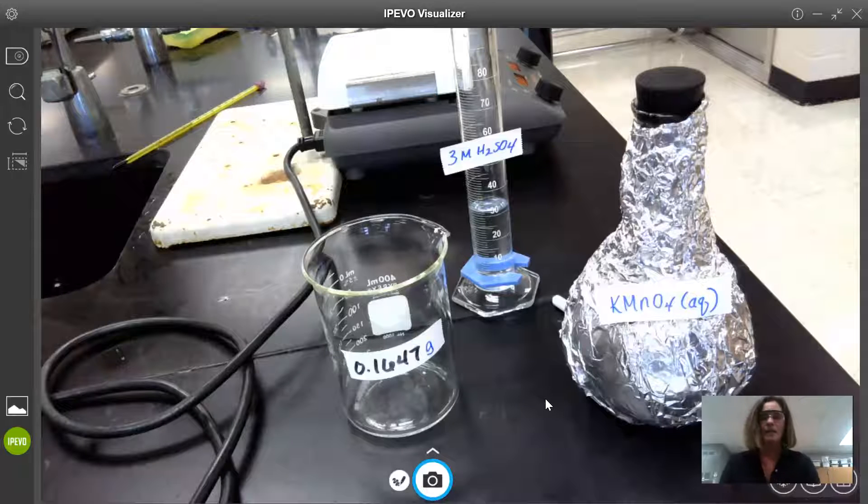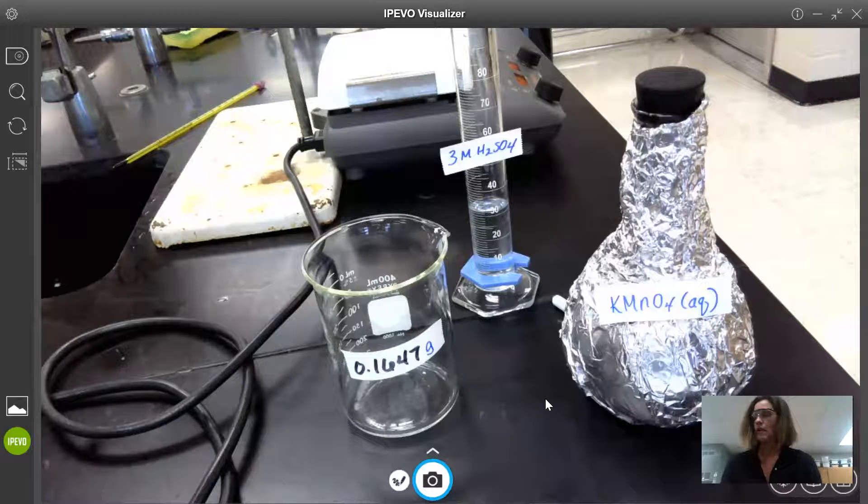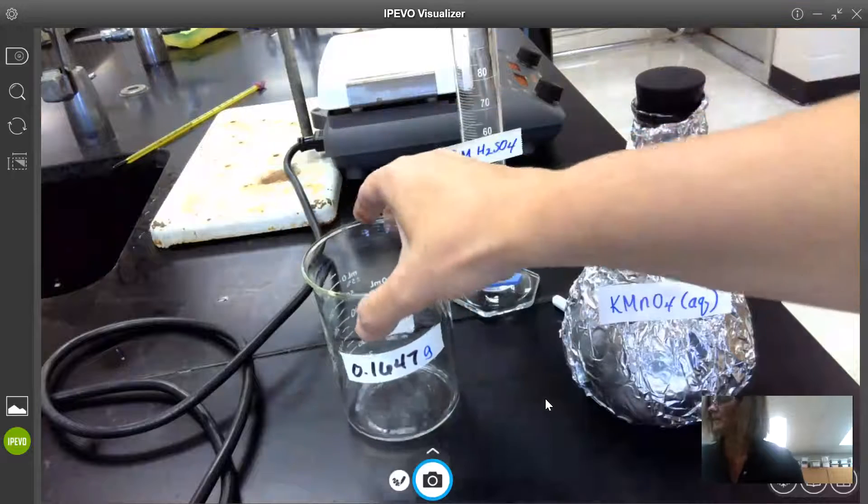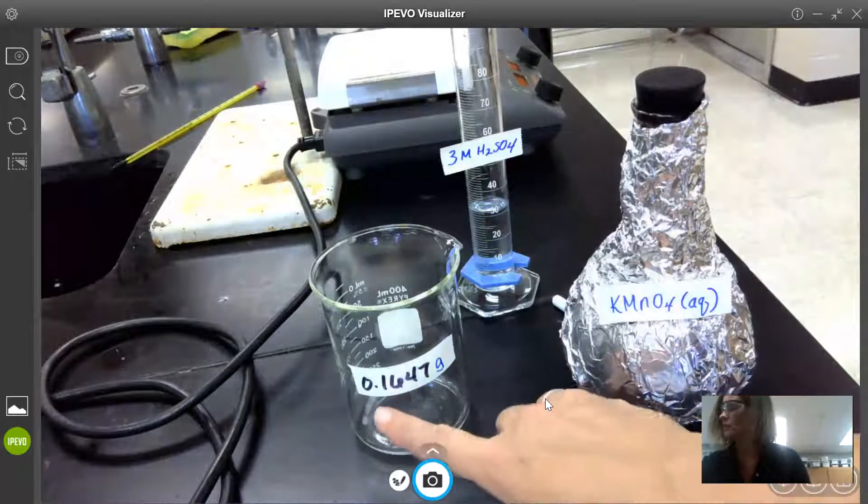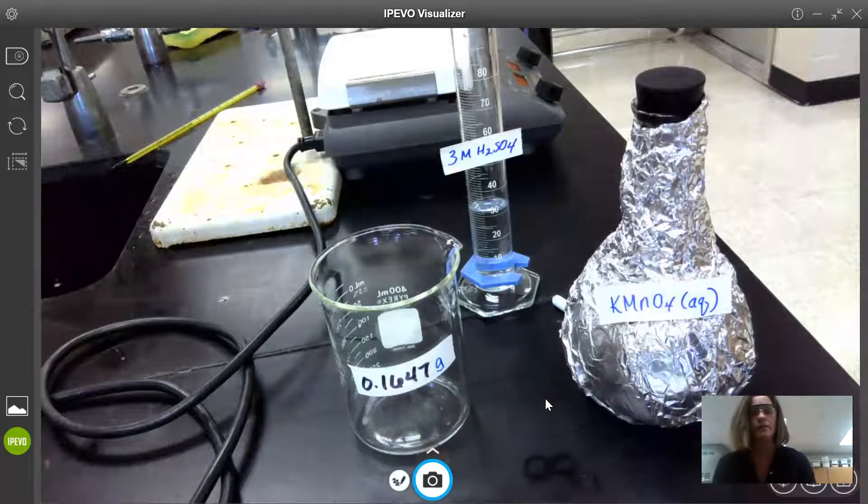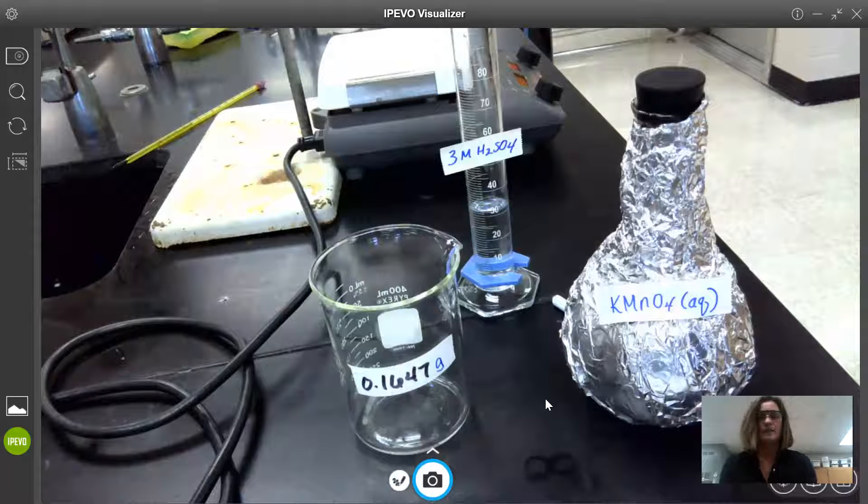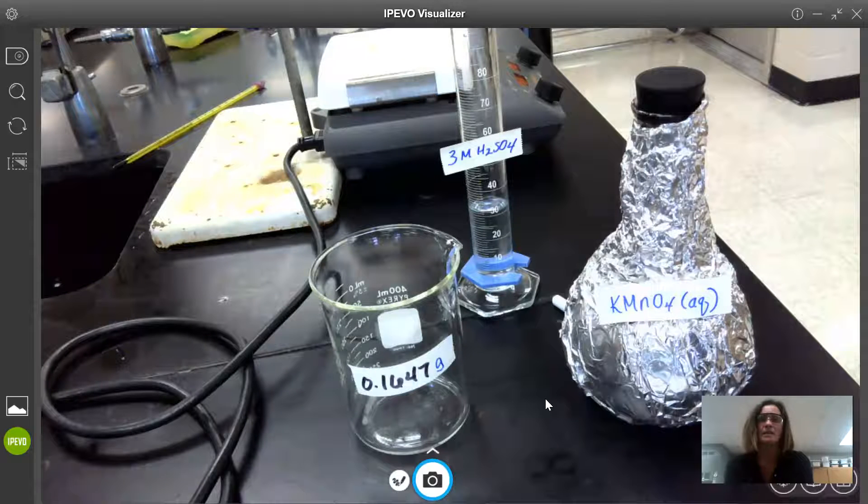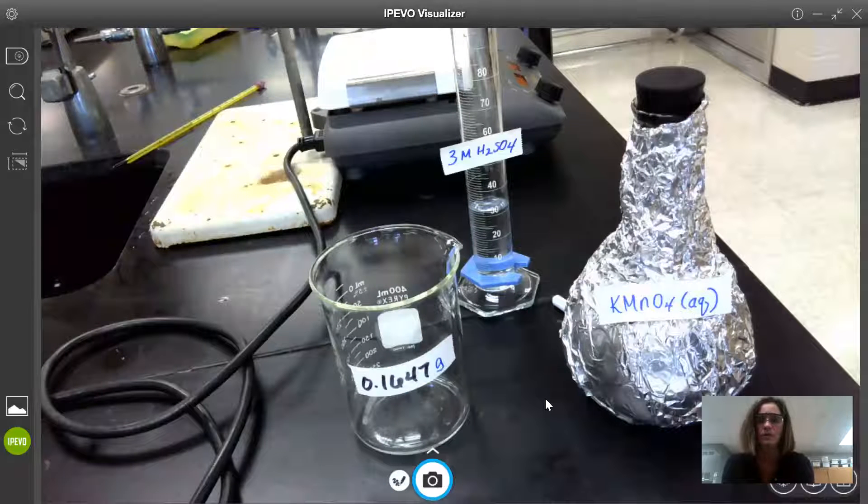So the sodium oxalate was measured out using the analytical balance and the mass I used was 0.1647 grams. I decided to use this amount based on calculation number two from your redox titration lab.